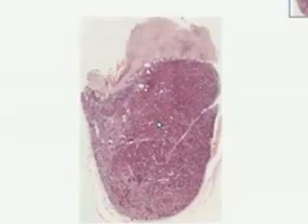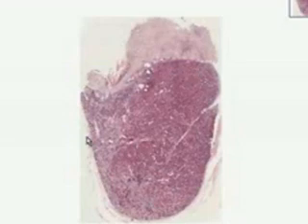No, this is not a tongue, even though it looks like one. This is your master endocrine gland. This is the pituitary. Classically, the pituitary is divided into the anterior lobe, which is embryologically developed from a structure called Rathke's pouch, and the smaller posterior lobe, which develops from a part of the hypothalamus known as the infundibulum.